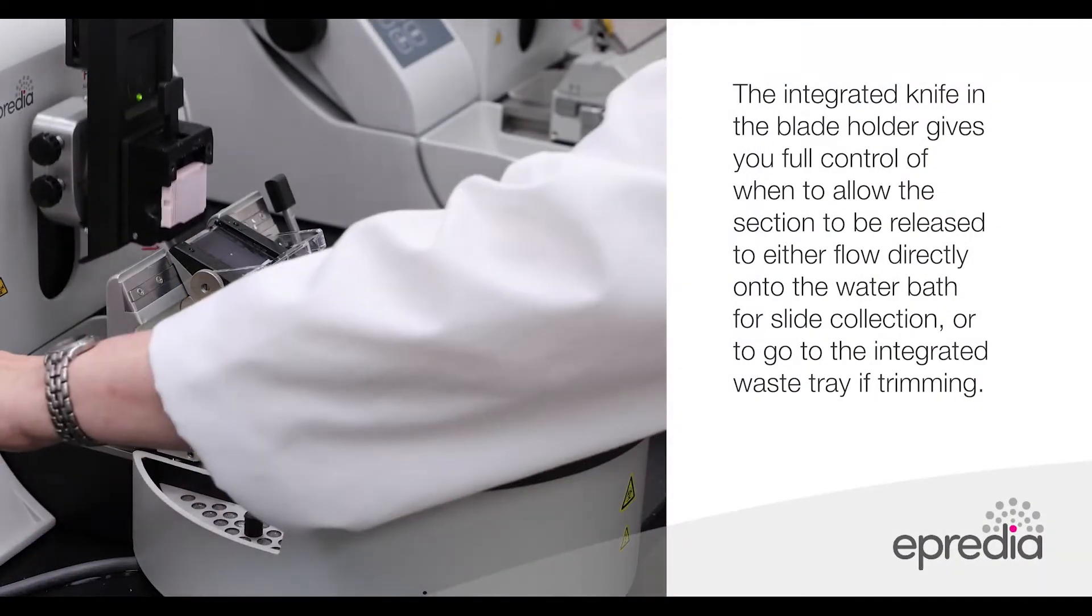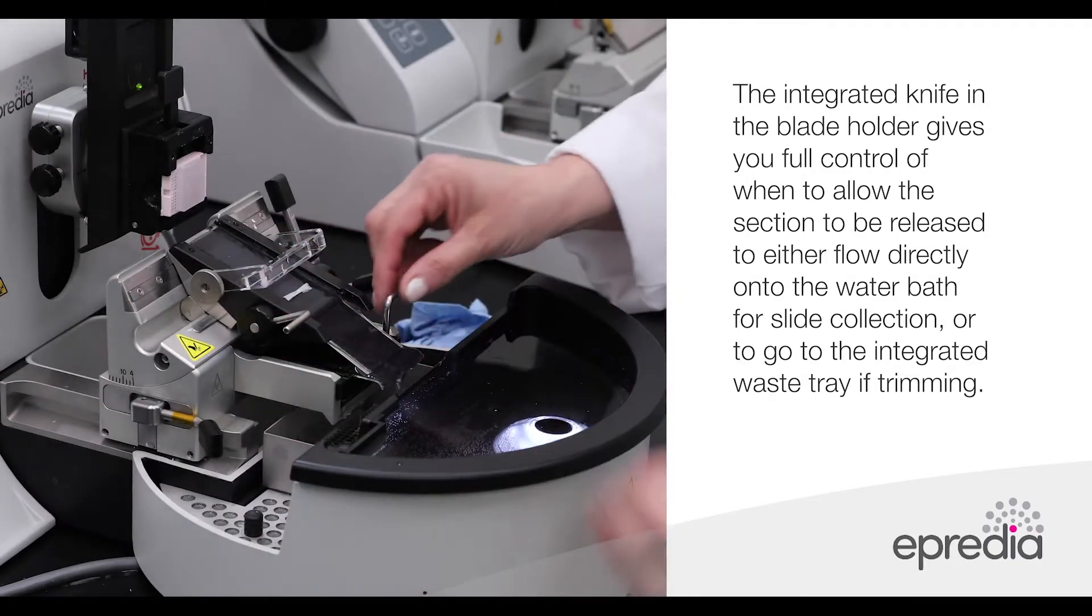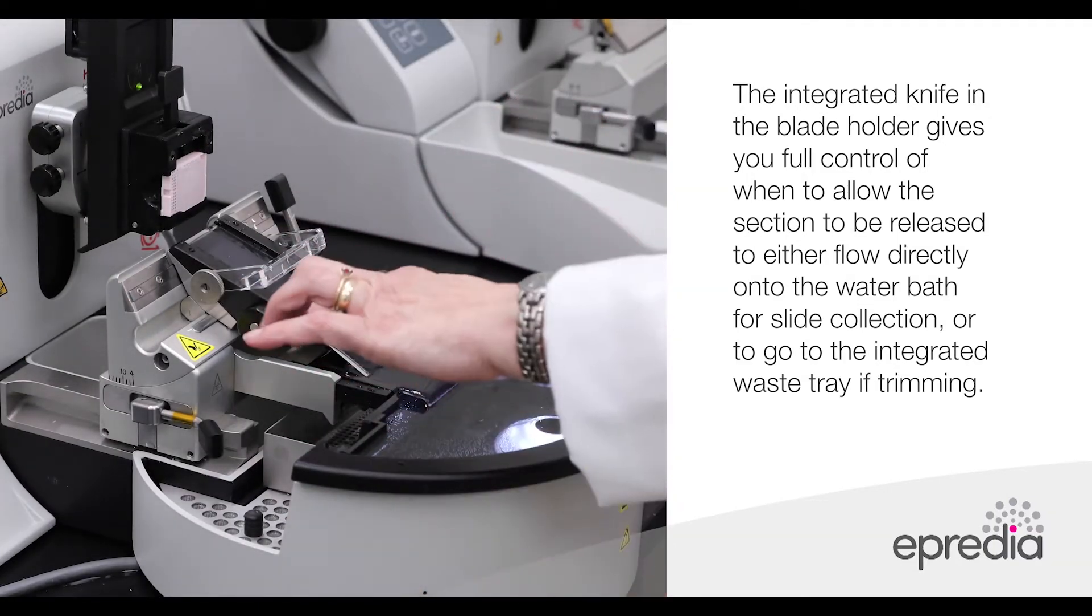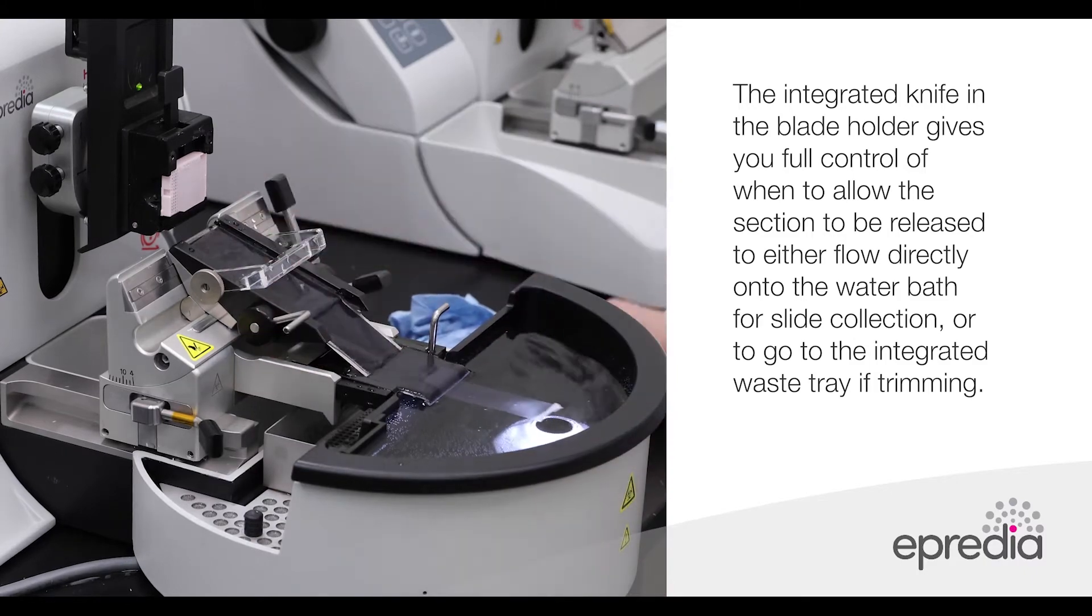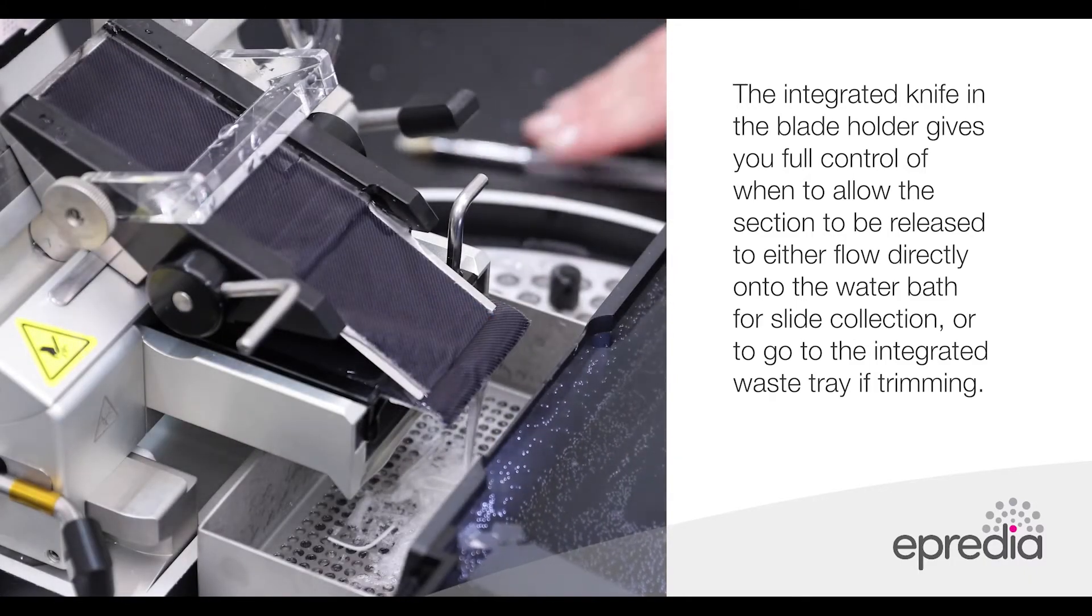The integrated knife in the blade holder gives you full control of when to allow the section to be released to either flow directly onto the water bath for slide collection or to go into the integrated waste tray if you're trimming.